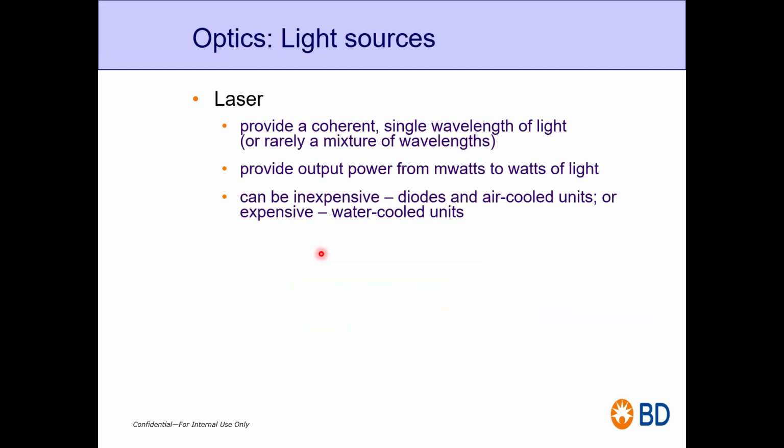Now, let's come to the excitation optics part. It has laser as well as prism. First, I'll tell you what this prism and mirror do. So you have a laser. Though laser is single pointed, you still want to focus it. That's why we have prism and lens, not mirrors, prism and lens. They will focus that laser light even more.